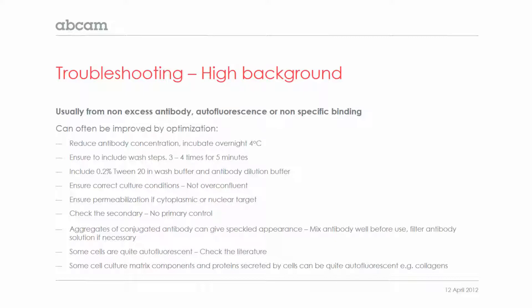Sometimes aggregates of the conjugated secondary antibody can give a speckled appearance within the sample. You can mix the antibody well before use, or even filter the antibody solution before use if necessary. Some cells are quite autofluorescent — check the literature for this. They may also be autofluorescent only at a certain wavelength, so choosing a different conjugate and viewing at a different wavelength may correct that problem. Some cell culture matrix components and proteins can also be quite autofluorescent, and again, changing the conjugate to view at a different wavelength may help.